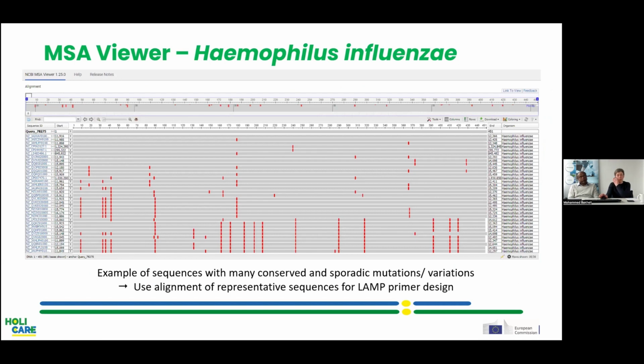Here I have prepared a screenshot of an MSA viewer of a gene from another pathogen from the HoliCare panel, which is Haemophilus influenzae.